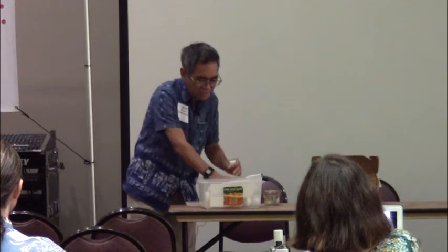Sprinkle the seeds in this little dish. Put the dish in here on top of the silica gel, and you sprinkle the green hydrated silica gel in another dish and put that dish next to the seeds. Now the seeds are going to let water off into the air inside the box, and the silica gel is going to pick it up. As long as the seeds are releasing water into the air, the silica gel stays green. When the seeds are completely dry, the silica gel will pull all the moisture out of the air in the box, and this green will turn to yellow. If you know the seeds are dry, you can take them out, seal them, and put them into storage.